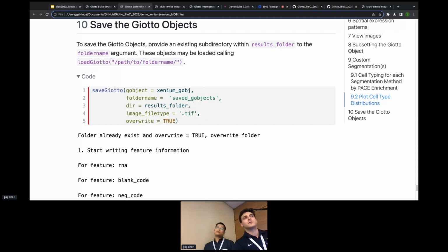Sure. So the question was if not using SingleCellExperiment would be a limitation, and if we have any considerations towards interoperability. One package that was brought up was AnnData, and another was Bioconductor. So I actually wrote an interoperability function to go from AnnData to Giotto and vice versa.